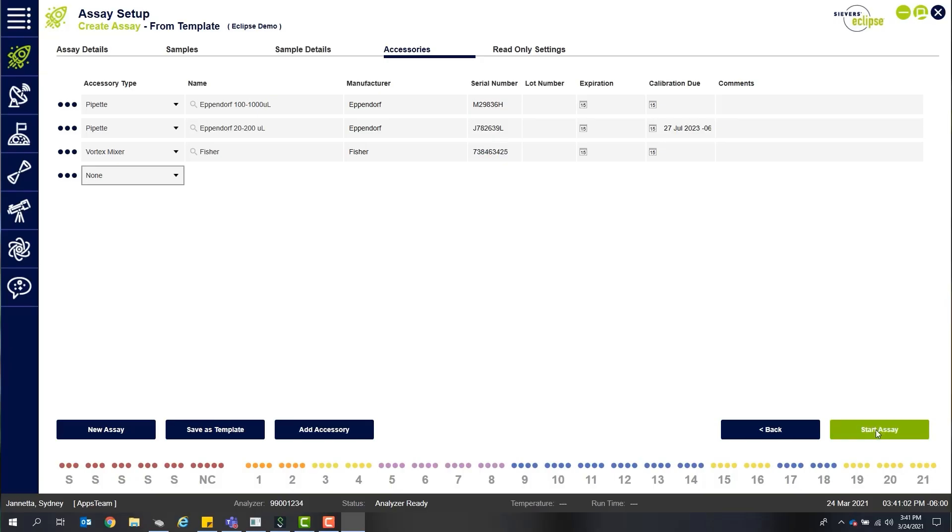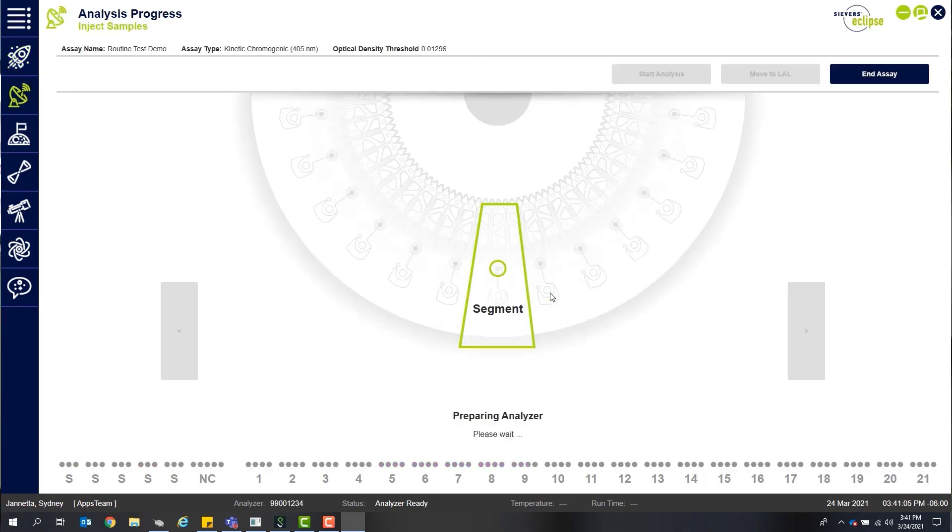With a streamlined software setup, an analyst is able to load an assay template and get an assay completely started in under 10 minutes.